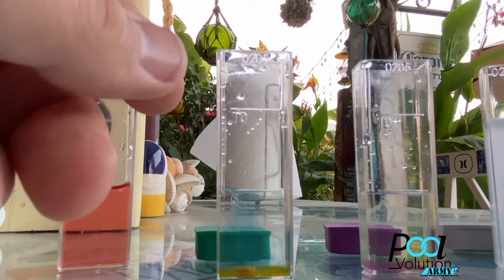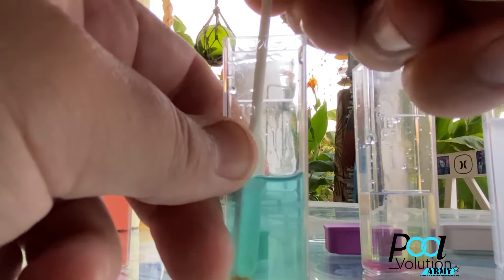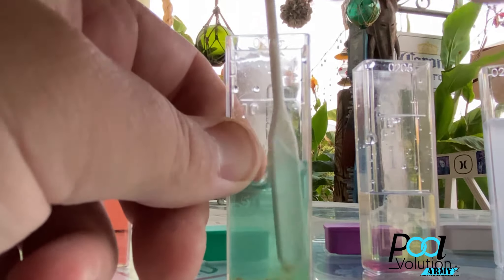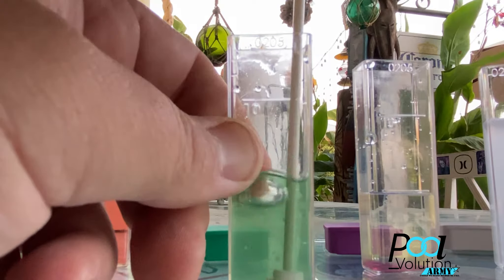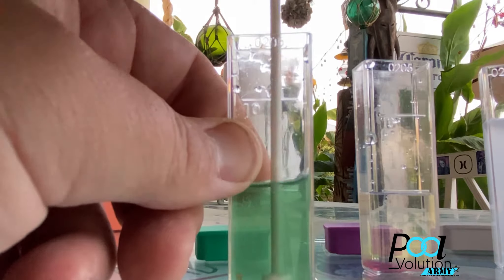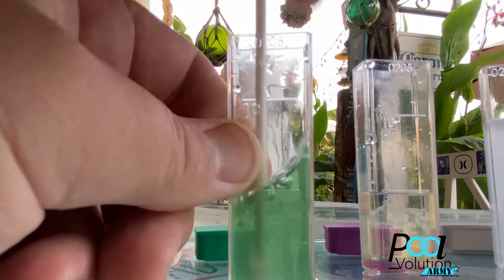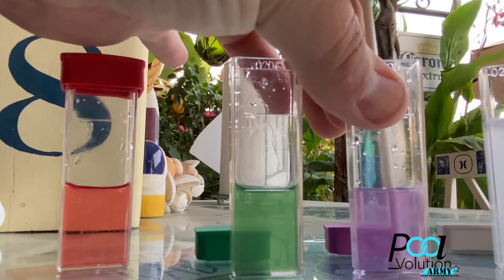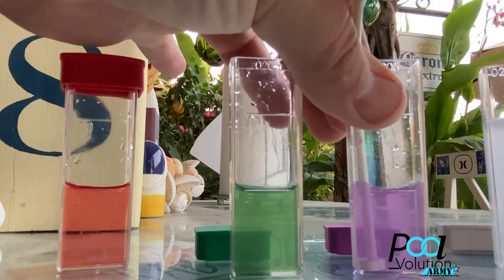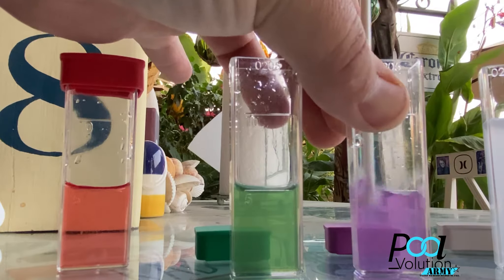Since I used the old generation back around 2017, I remember crushing these tabs. What I do is use the stir part of the stick to crush the tab first — it's always been a lot easier for me — and then I use the other side as the tab crusher. A lot of guys say crushing these tabs takes too long, but if you use the other side of the stir stick to do a knife action, it's a lot faster. I filled all vials at once, did the reagents and those tests, and now I'm just crushing tabs quickly to go straight through all the remaining tests fast and easy.